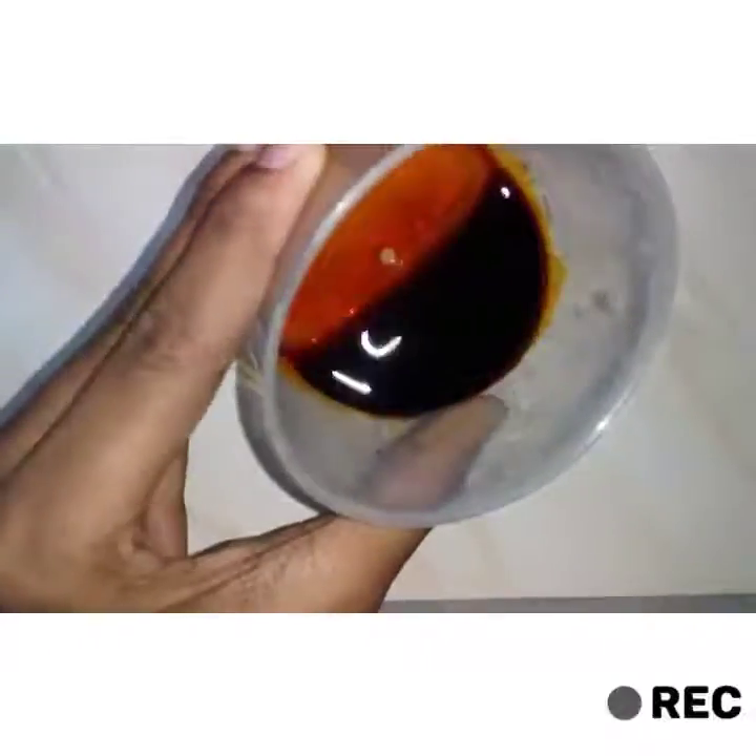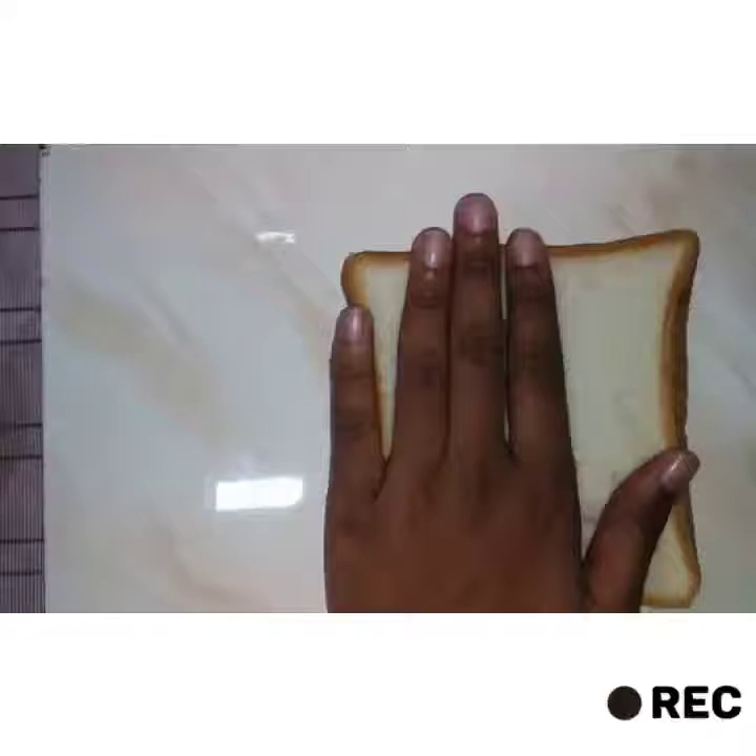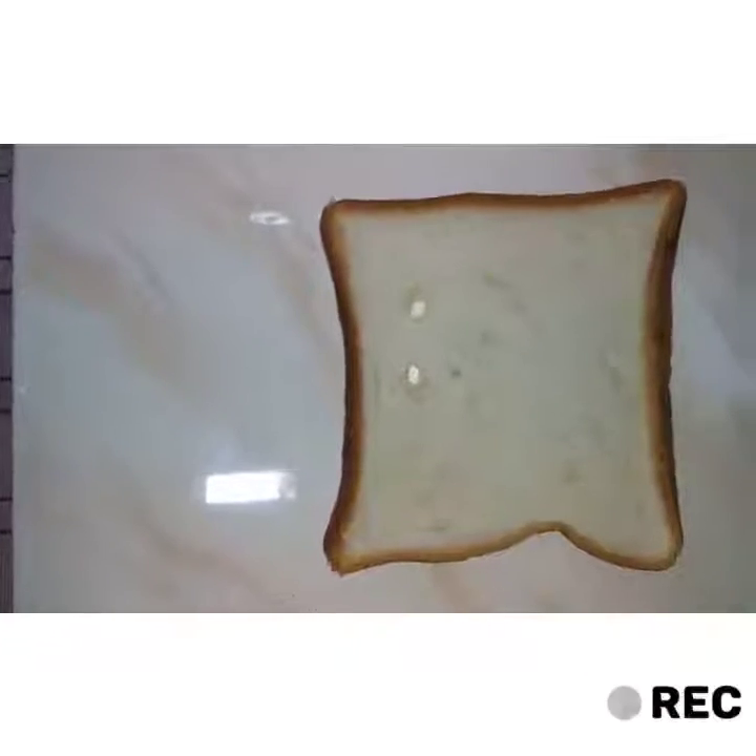You can see the color of the iodine solution — it's yellowish brown in color. Then we'll get the slice of bread.